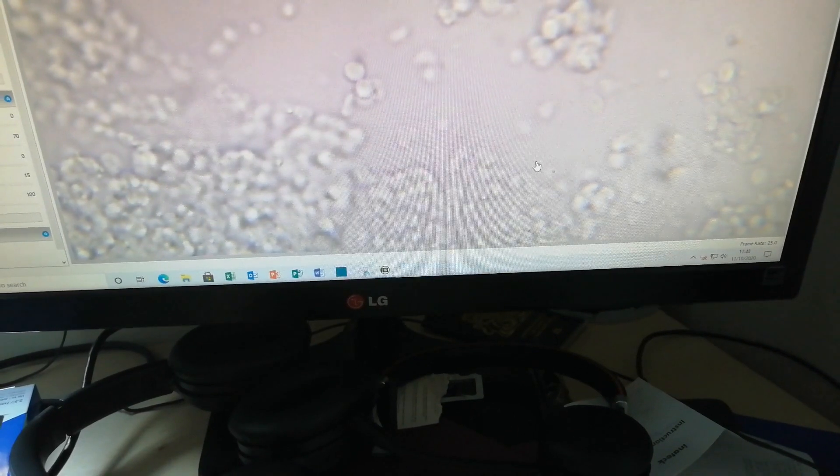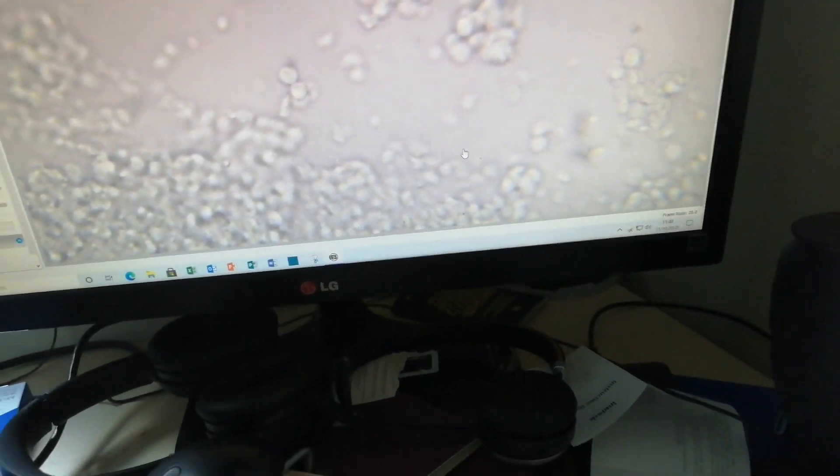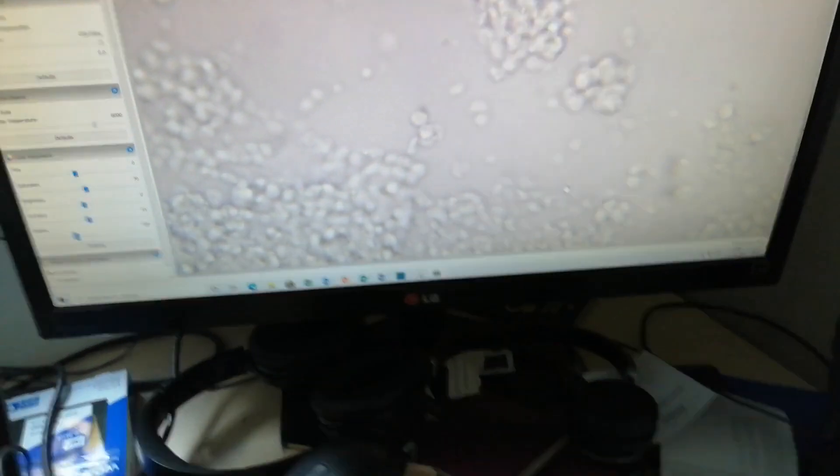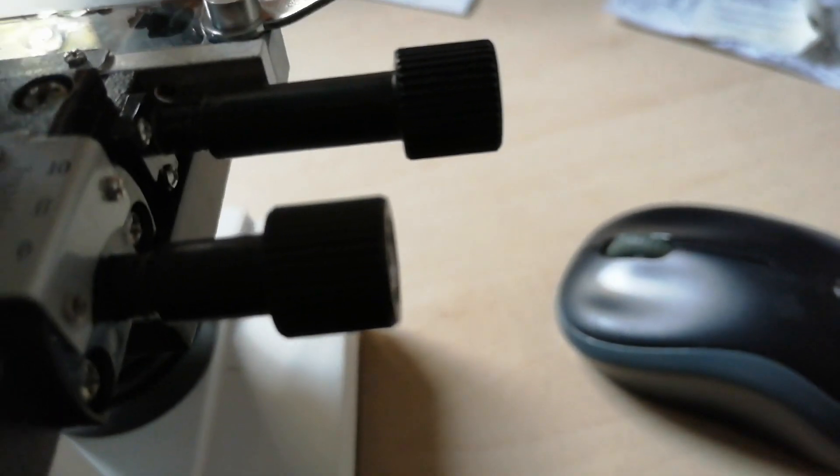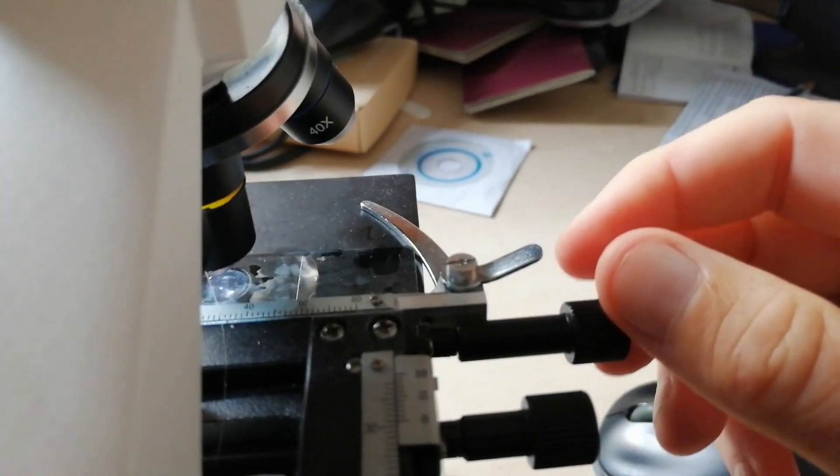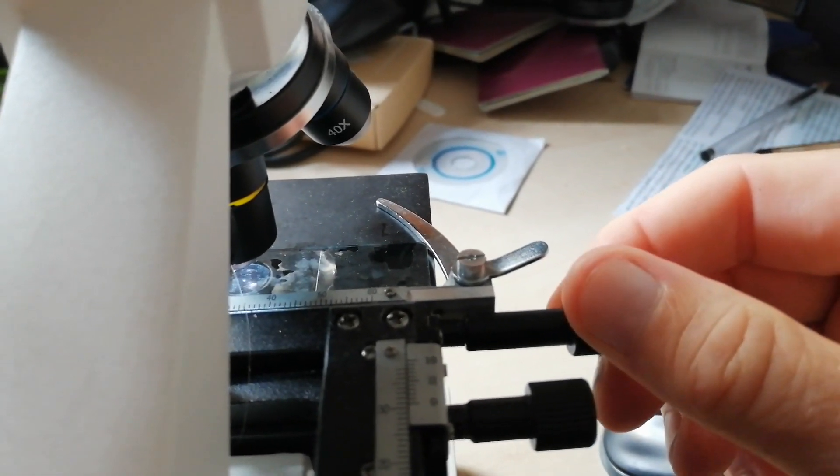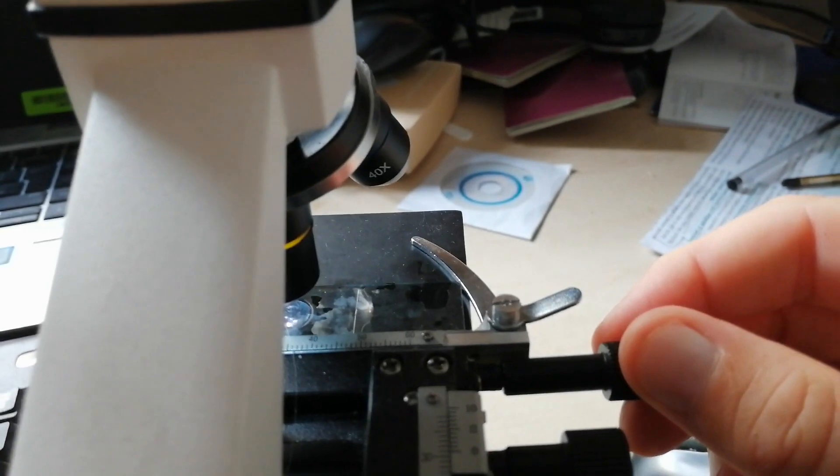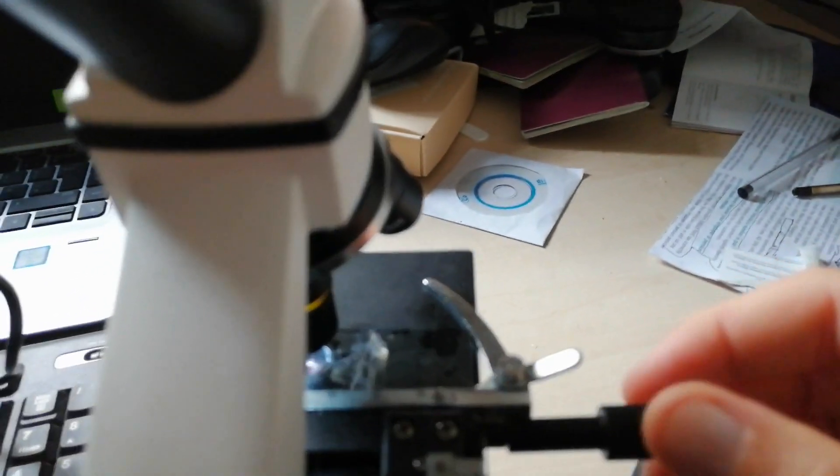Right, let me get on with this. If I find anything I'll share it with you. Just to show you a bit more, the slides on there probably won't focus too well. It's a case of if you move it, this is moving the platform up and down. Just getting in there and then these two dials move left or right or back and front, so it's kind of case of working your way around the slide slowly.